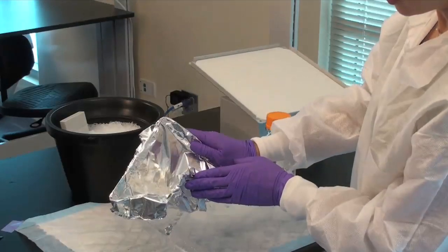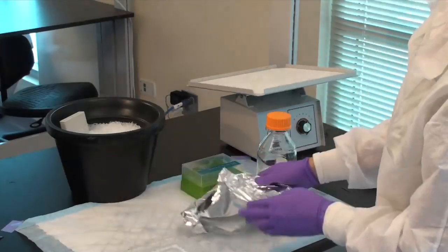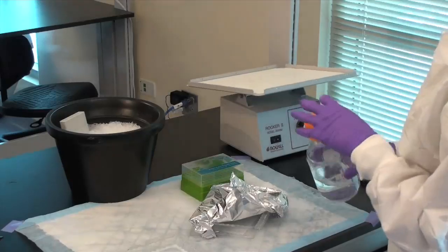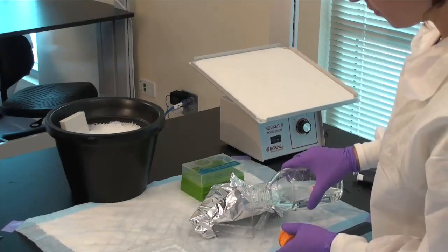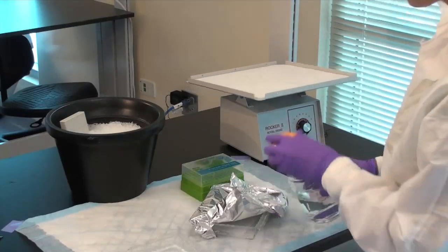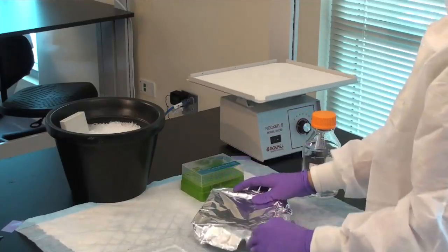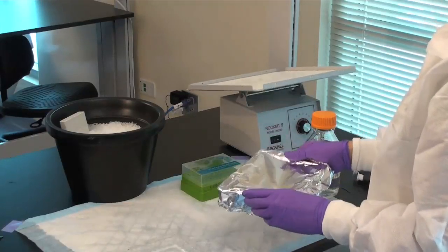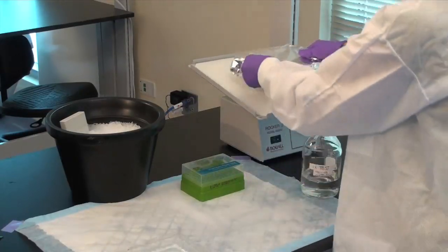If you're using an enzyme-linked secondary antibody, light protection is unnecessary at this step. You'll need to add a substrate for the conjugated enzyme afterward for visualization. If you're using a radioactive secondary antibody, take precautions to avoid unnecessary human exposure to the isotope.